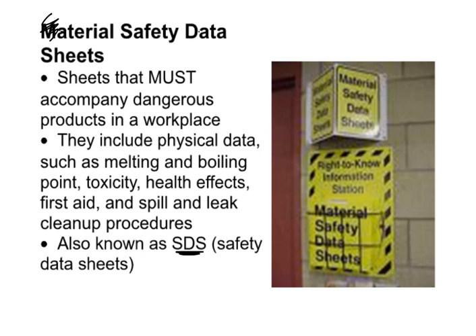I think the rationale was they wanted to make it a little less confusing, and they also wanted to make this universal, so that the rules in Canada were the same as the rules in the States, same as the rules in Australia, same as the rules in Europe. Because before this, every nation kind of had their own safety setup, and they wanted to make this a little bit more universal. Does that make sense? So my notes here are about the old safety data sheets, but I just modified it and said this is the new name. Okay?